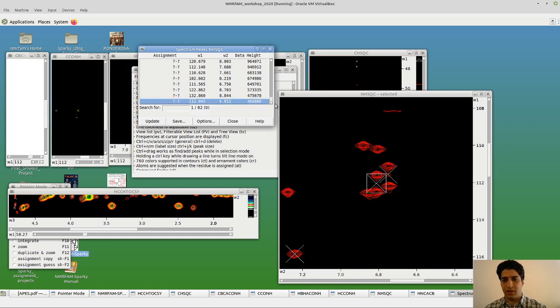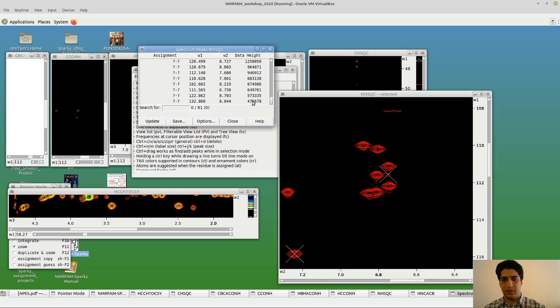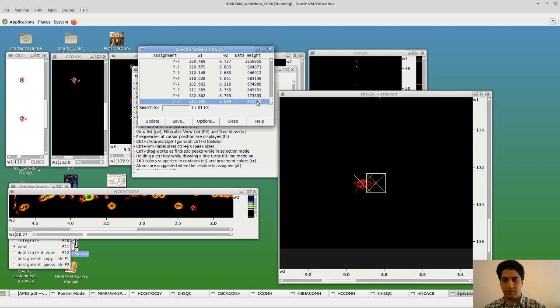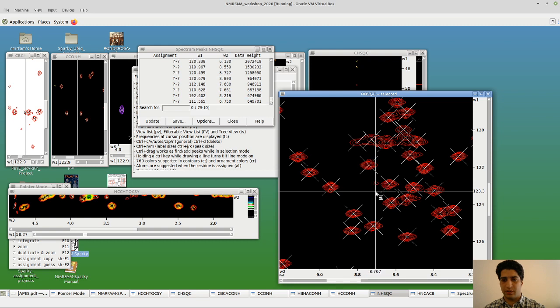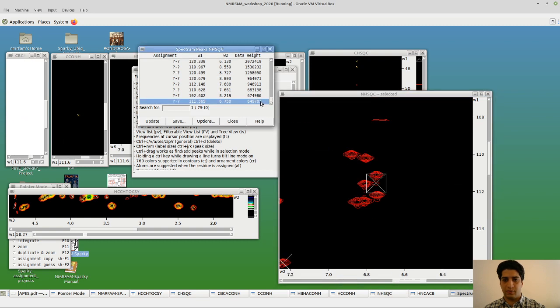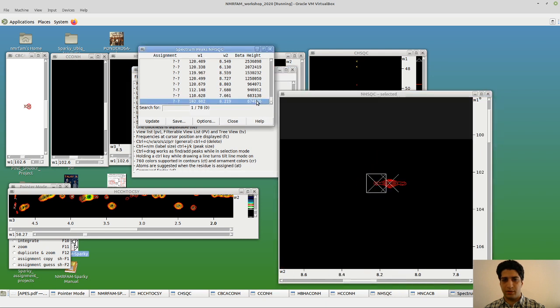Let's test something else. Okay, seems like this one is not a peak either. Delete. Next one, not a peak. Next one, can also remove this. Next one, remove it.